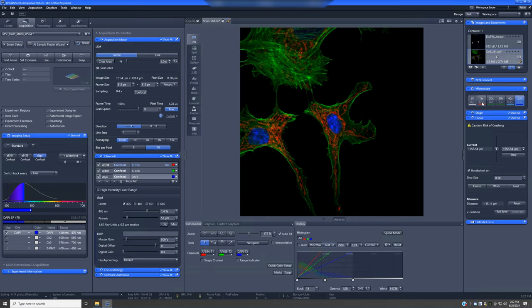The 5x is the objective that you typically use to make maps, both as part of the AI sample finder, or if you want to make maps later, that is the preferred option.